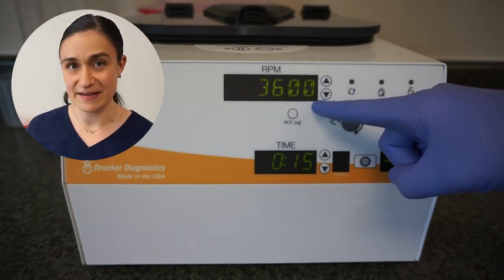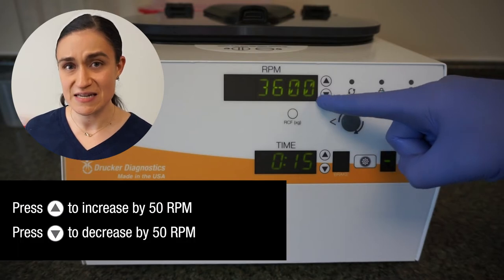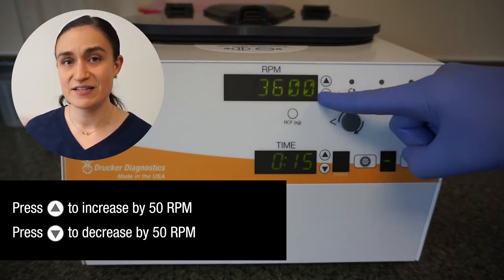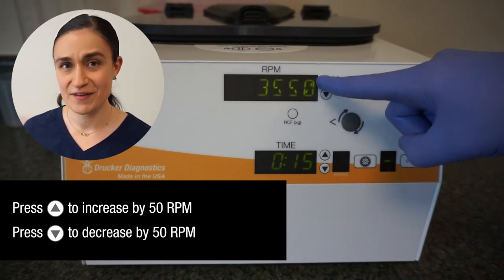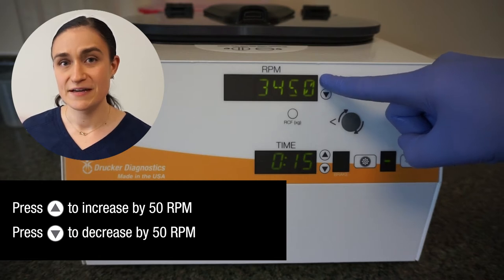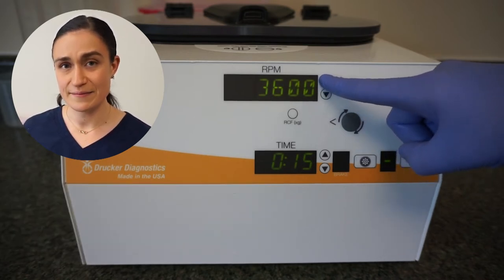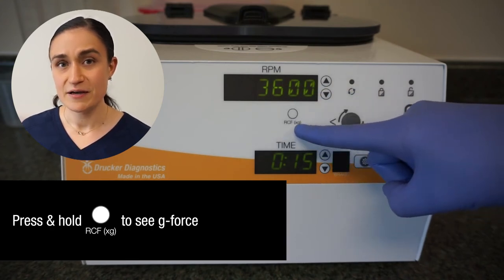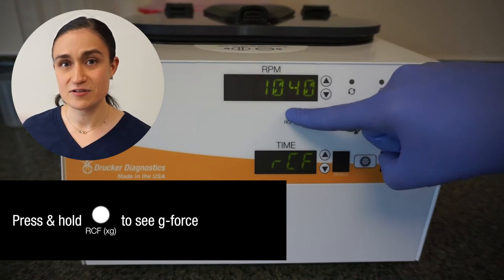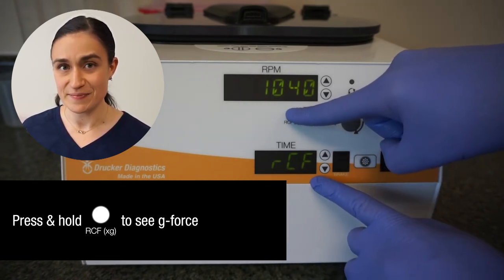Now let's take a tour through the controls. All of the SARA-12 controls are found on the front of the centrifuge right here. The RPM screen displays the currently selected speed in RPMs. You can adjust this using the up and down arrows to the right of the RPM screen — a single press up increases by 50 RPM and a press down decreases by 50. If you accidentally overshoot, you can use the down arrow to get back to your desired speed, and likewise if you drop it too far, use the up arrow. Underneath the RPM screen is the RCF XG button, which toggles the RPM screen to show g-force instead.